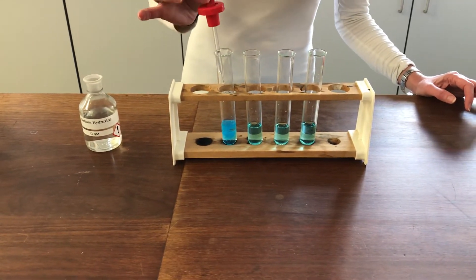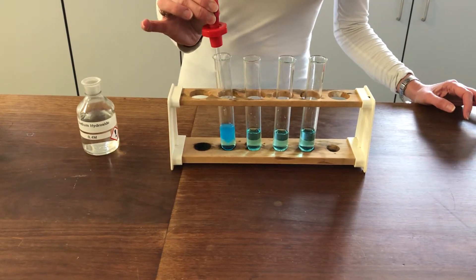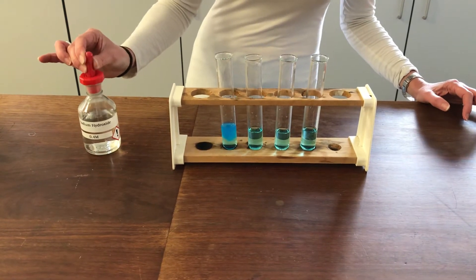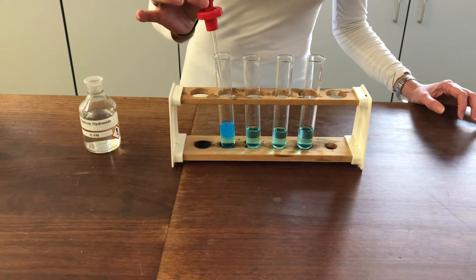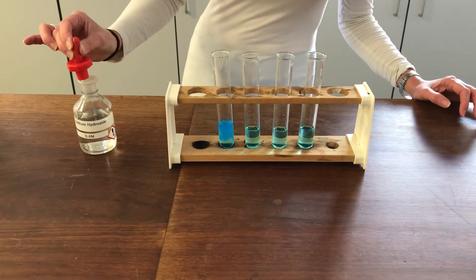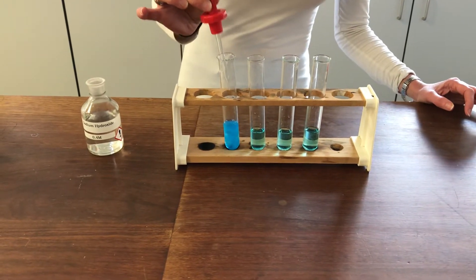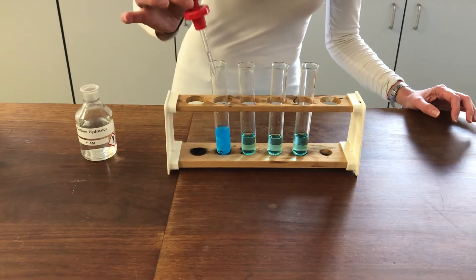What's going to be interesting is to compare what happens when we add excess. With excess sodium hydroxide, you can see that nothing very much is happening. I've still got my blue precipitate and there doesn't appear to be any evidence that it's becoming any more soluble.